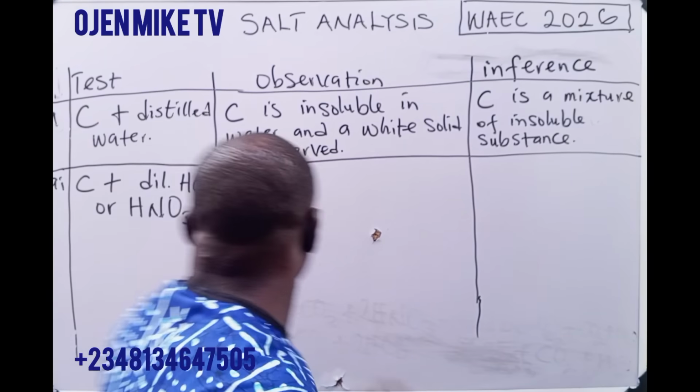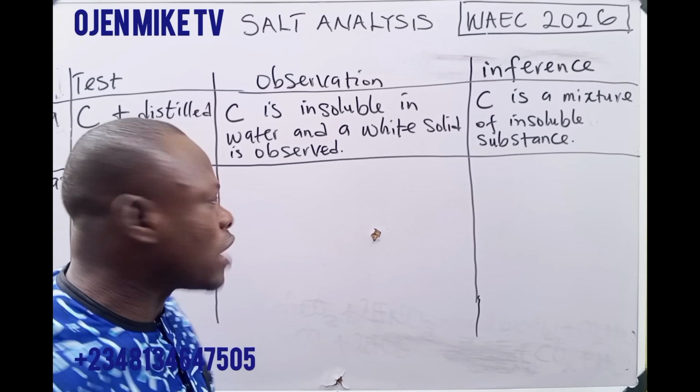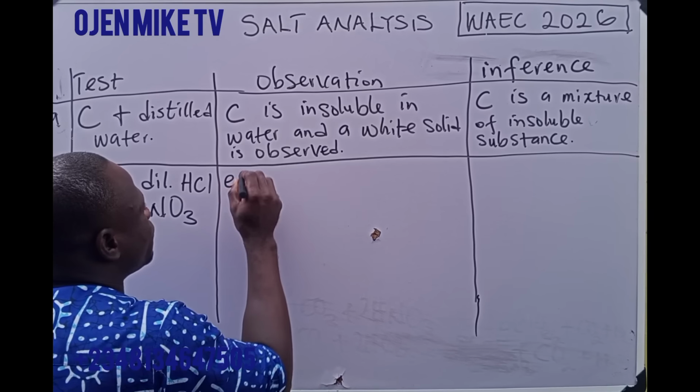Now, moving further, let us treat with this one, dilute HCl. Now, when you put any of this HCl, what you are going to observe is effervescence. Either you put this one or this one, effervescence is on. Effervescence.